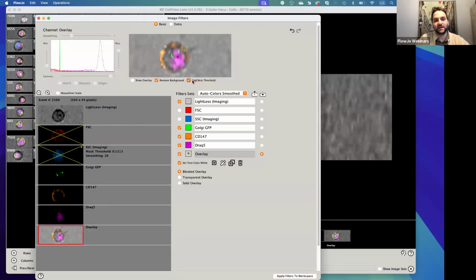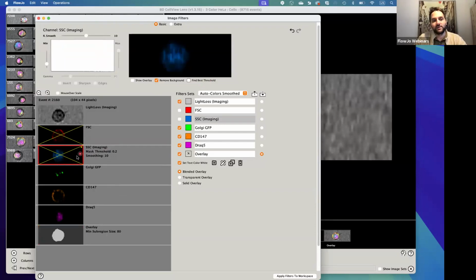If you want to adjust that, you can do that by holding the Shift button. So you see here, hold Shift key and select on the imaging channel. What this will do, it will now activate this overlay, and you see what exactly region you include in here.